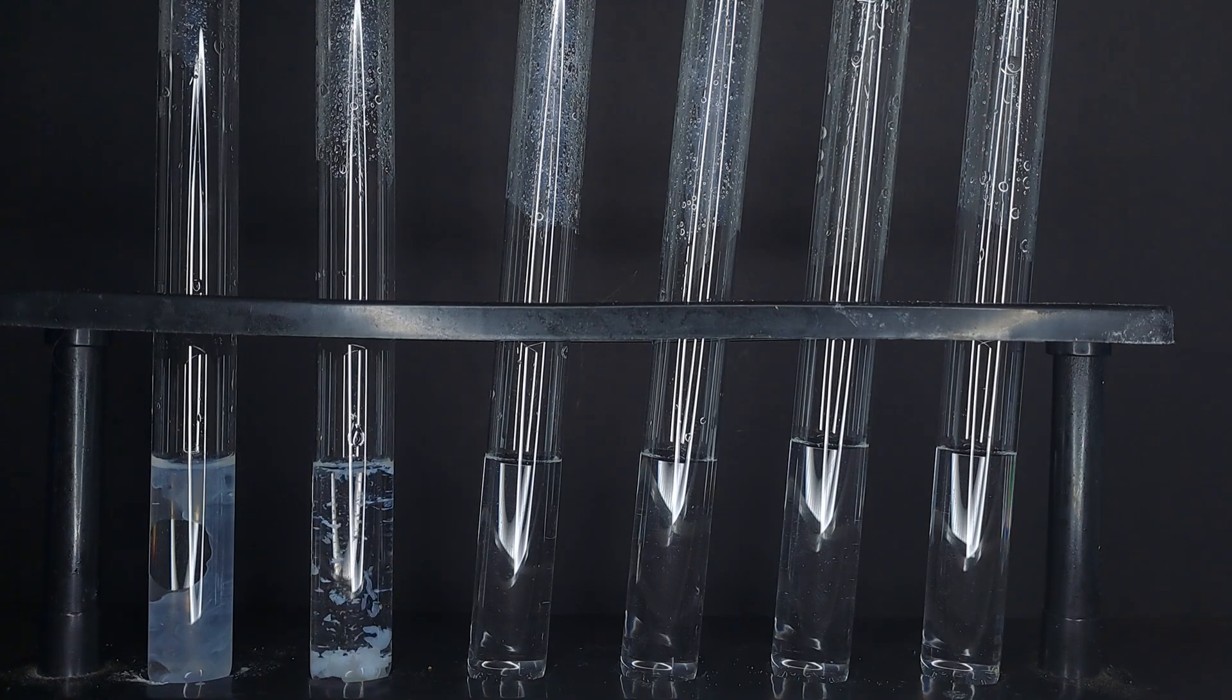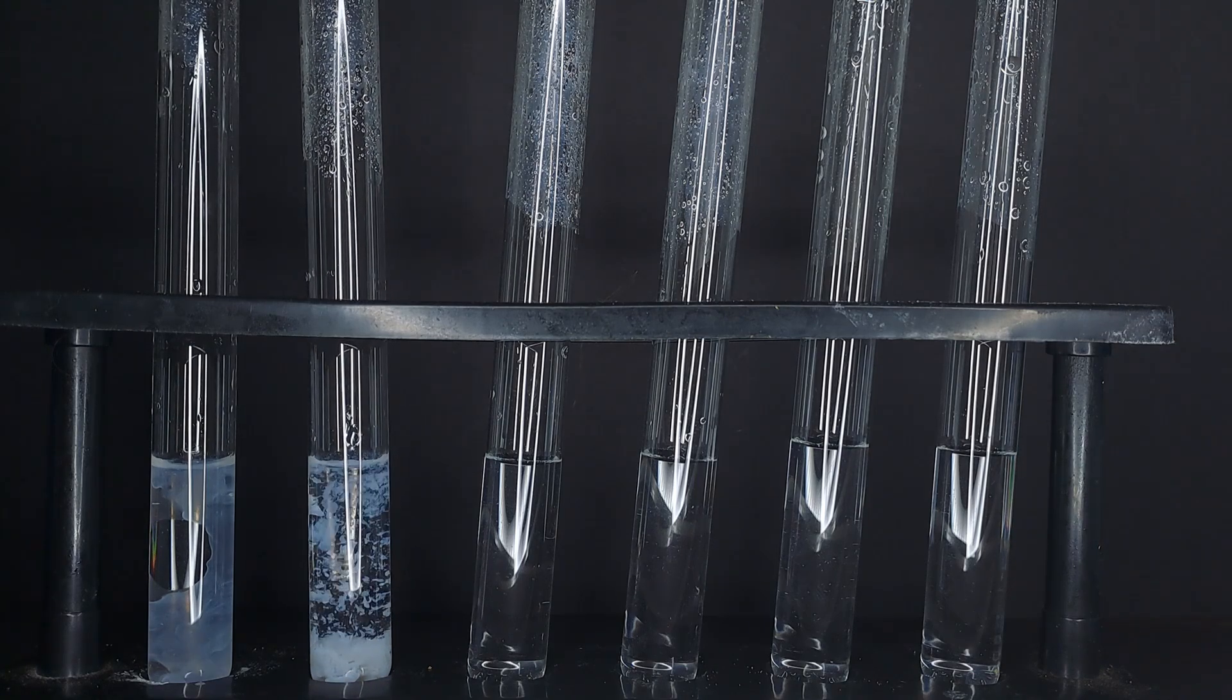Adding potassium iodate to the second test tube results in a white flocculant precipitate.